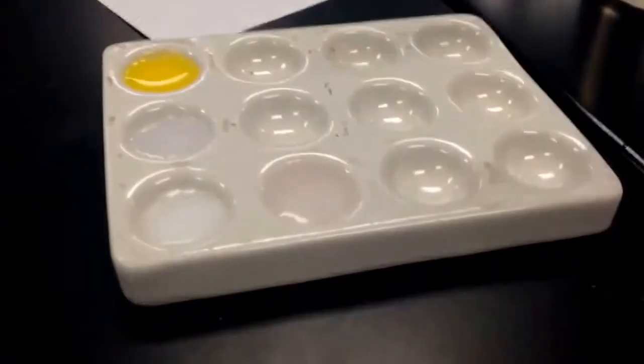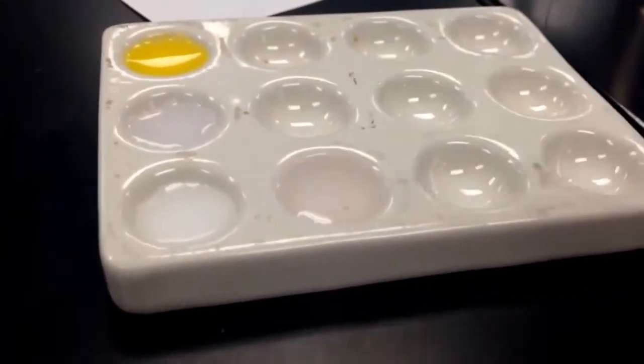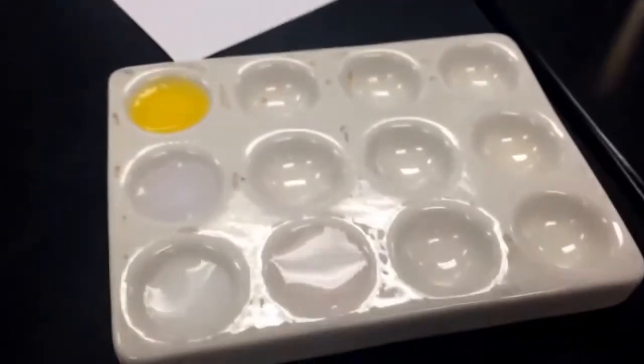So in the sodium carbonate and hydrochloric acid, unlike in the mixtures before, there was no precipitate at all. There were only some bubbles, but there was no actual precipitate that resulted.